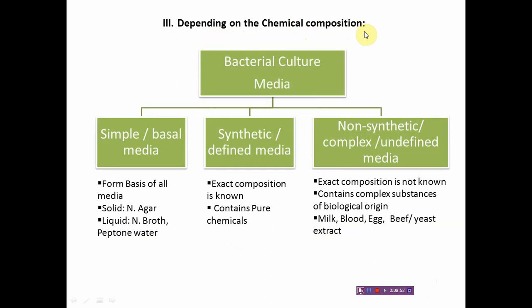Depending upon the chemical composition, the bacteriological culture media can be classified into simple or basal media, synthetic and defined media, non-synthetic, complex and undefined media. Now what is basal media? These media are simple in composition and form the basis of all other media. Nutrient agar and nutrient broth are the examples of solid and liquid media respectively. Peptone water is another example of liquid medium.